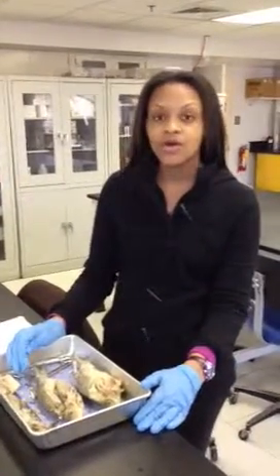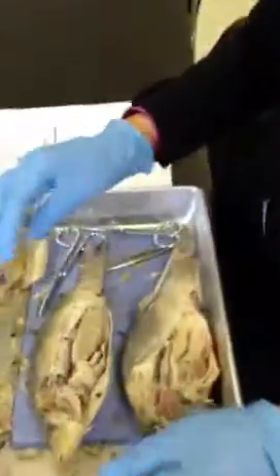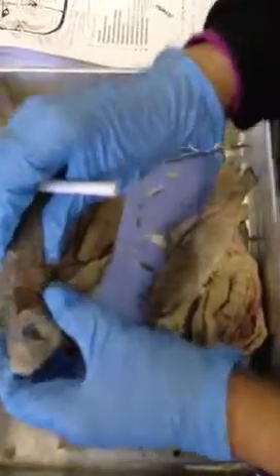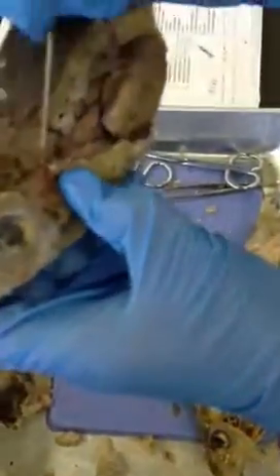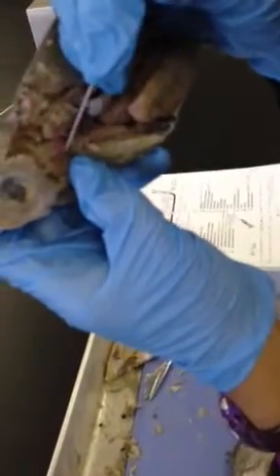Hello, we just finished dissecting the perch, and now we're going to go over some things of the digestive system, well, really the circulatory system of the perch. So, we have some arteries here. These are efferent branchial arteries, and they go into the holobranch. So right here you have the fourth one, the third, the second, and the first.